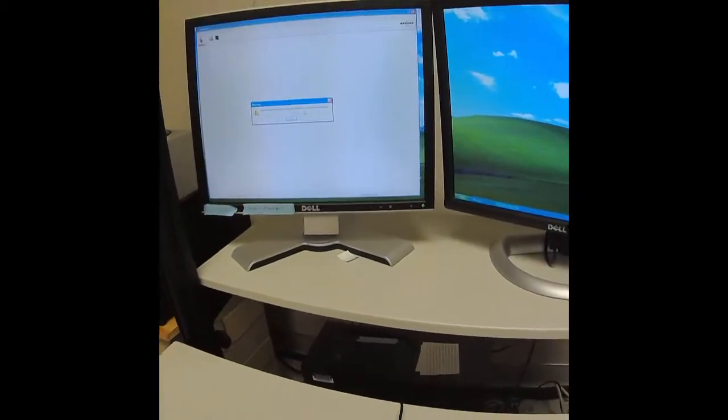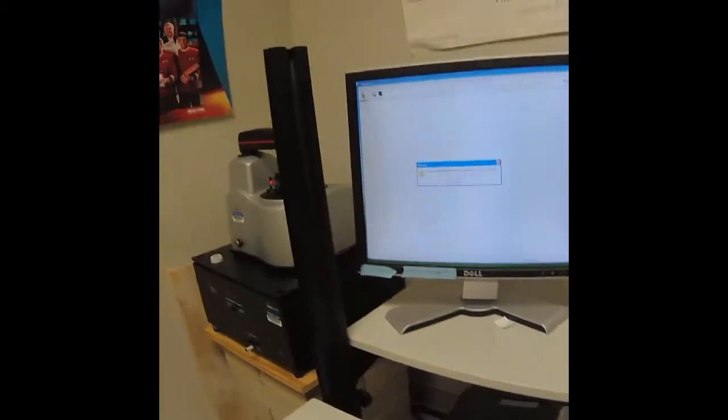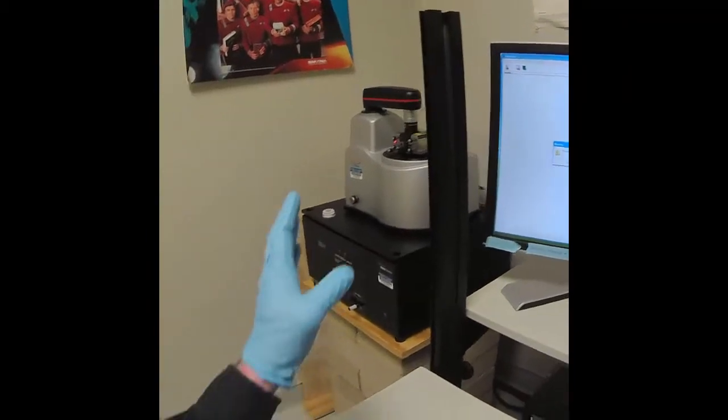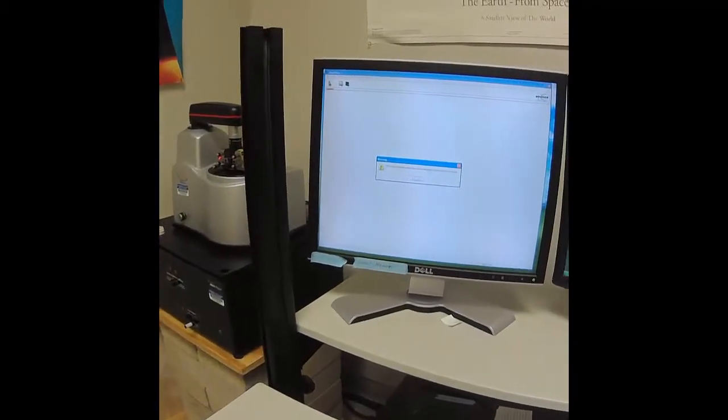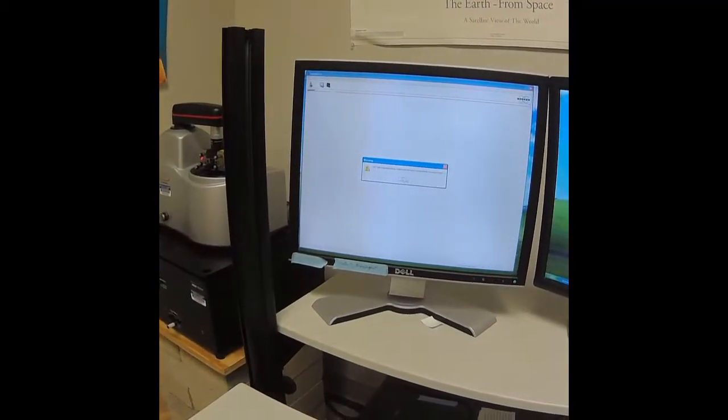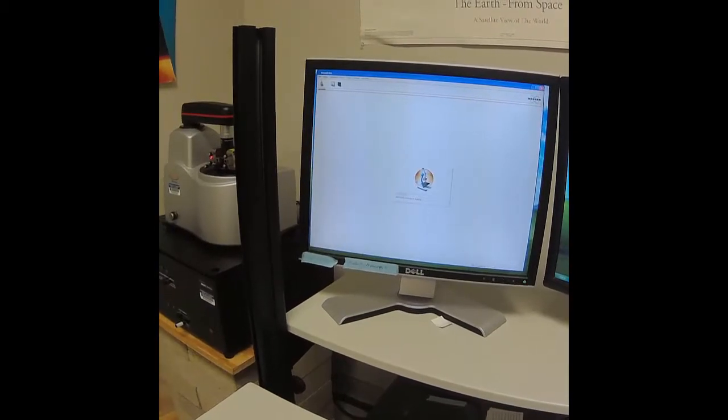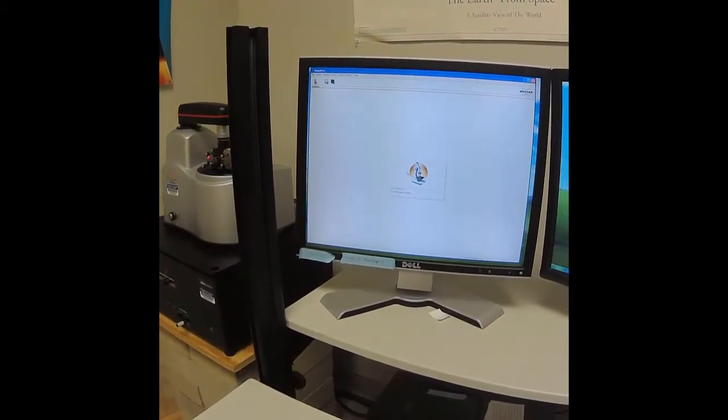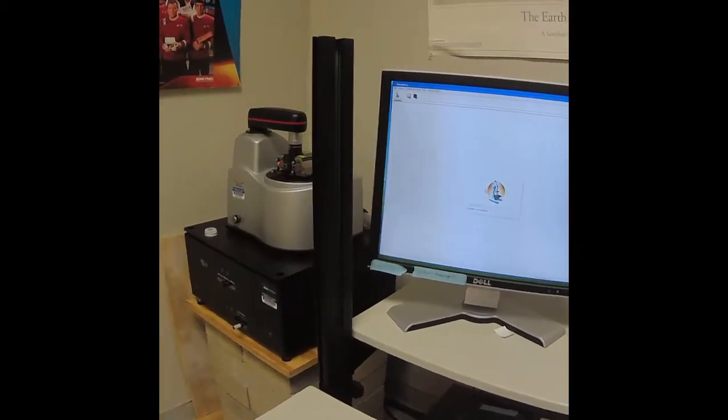Green light goes on. And here's a series of clicks as the controller connects to the computer and the microscope. Once that happens, we can click OK.